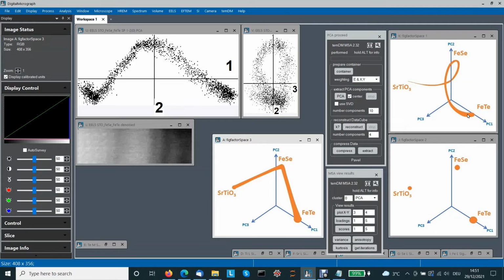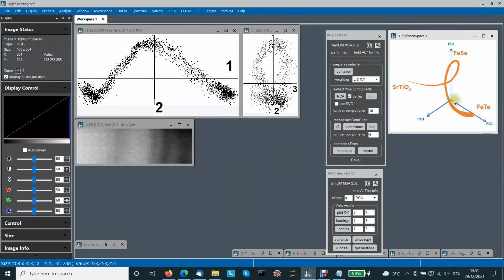Always, I would say always, when we recast our data from one set of coordinates to another, we have a chance to make new science. For instance, we see clearly the variation line in this multidimensional space. If we project all our data onto this idealized line, we have a good chance to denoise our data much better than with the standard PCA projection. I think introducing new carefully chosen coordinates is always beneficial for science.